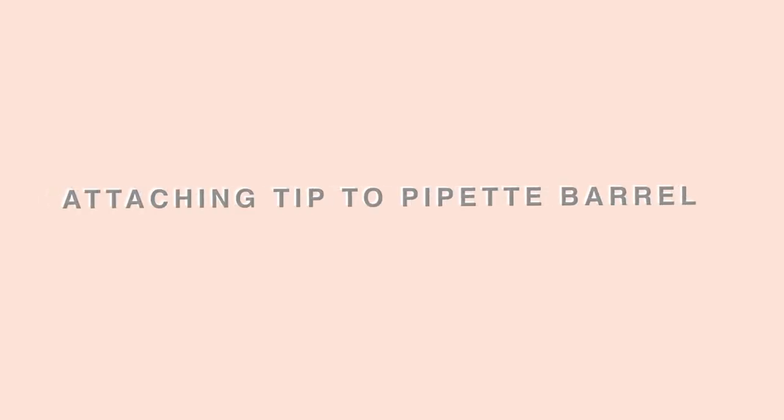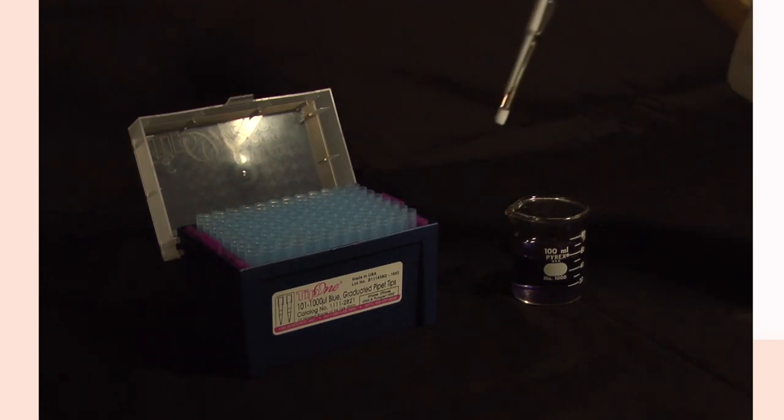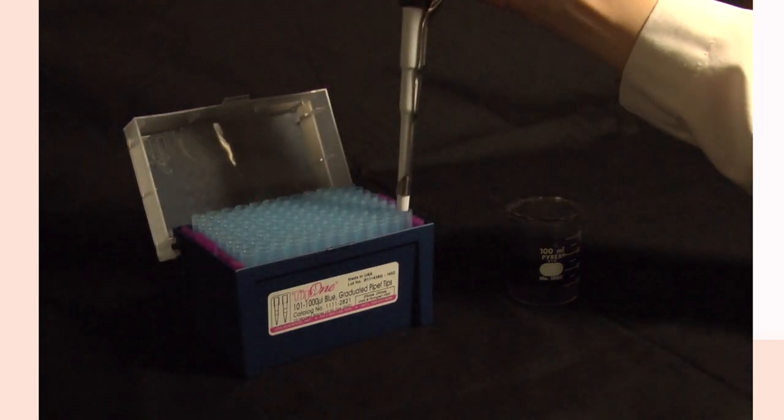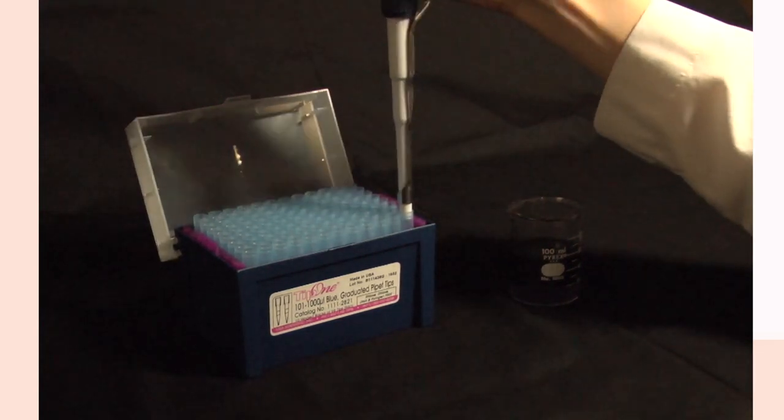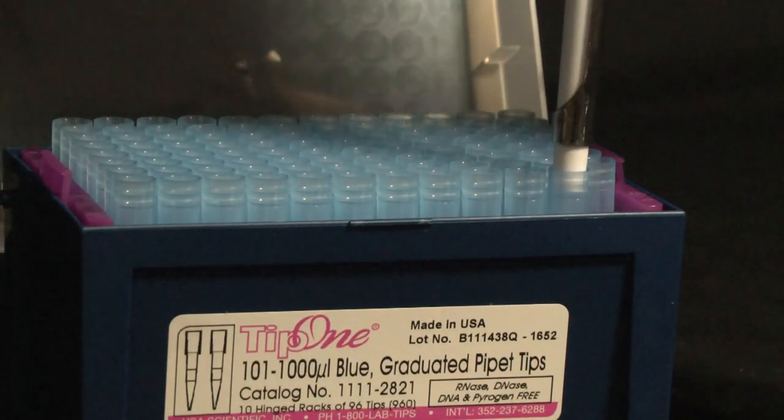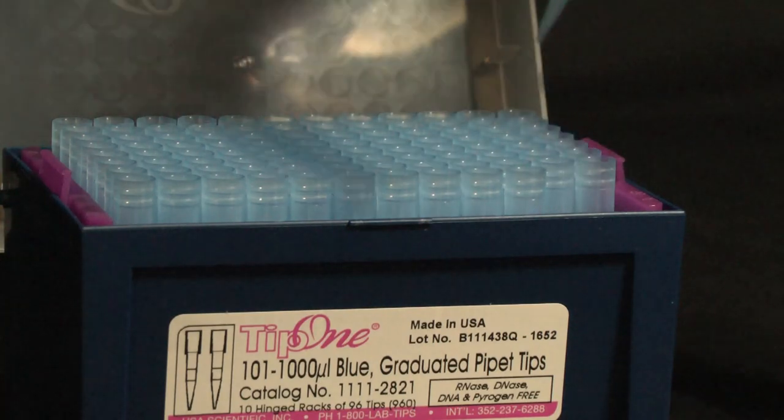In order to attach the tip to the pipette barrel, press the pipetter firmly into the top of the tip. You will not need to fasten it by hand. Press enough that the tip is attached, but avoid using too much force that would break the barrel.